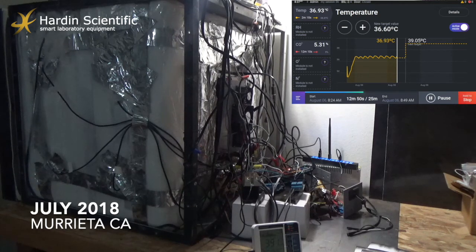Okay, so now we're pretty close to the next step for the temperature module. Okay, another 1 minute, and the system will try to increase the temperature after that automatically.